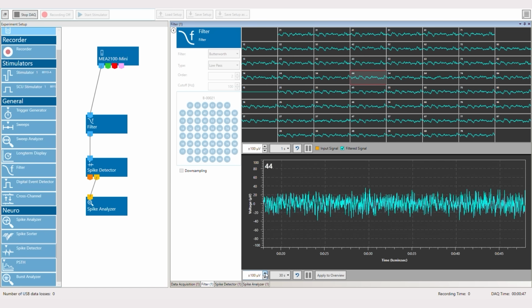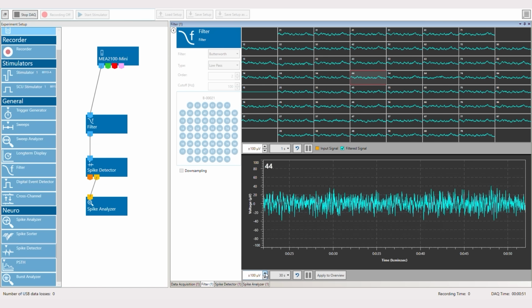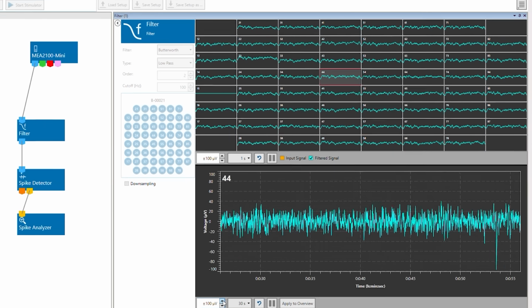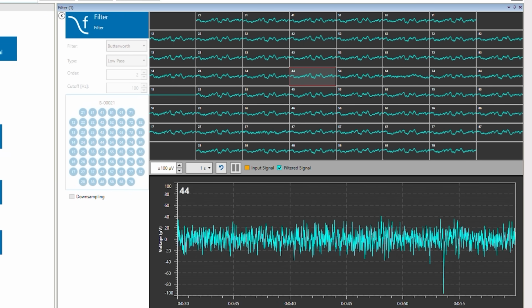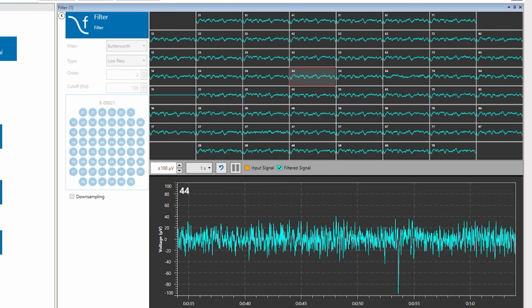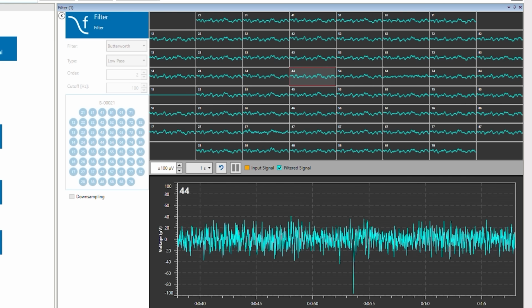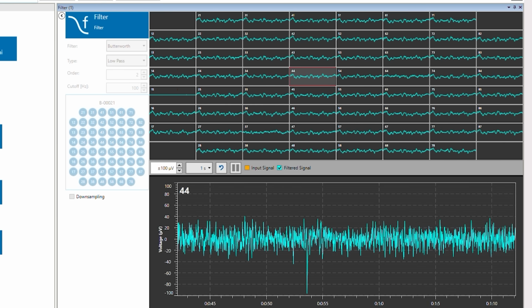Starting off, this is the program interface for controlling the system and taking recordings. Starting first with the array for multi-channel systems with a blob of Jerry on it. Right off the bat, the first thing to notice is that on average, the electrical activity is lower voltage than neurons. And that kind of makes sense, since it's easier for discrete units of a cell to build up and release significant pulses. But we do see distinct spiking activity where the voltage swings rapidly.